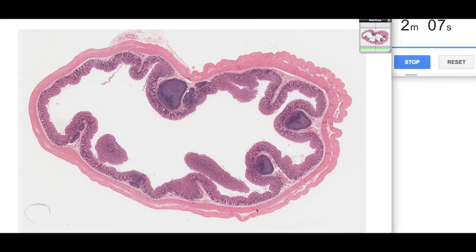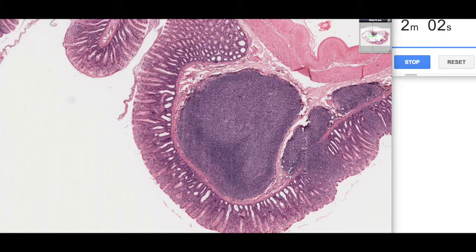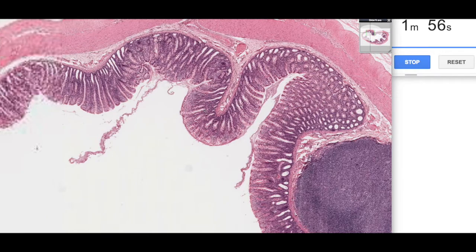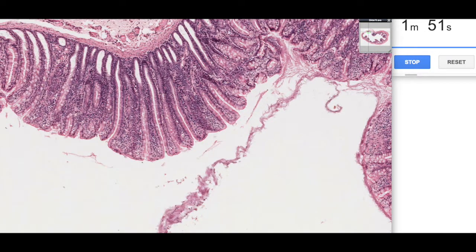If we have a look at a bit more detail of the mucosa, we can see that the mucosa of the large intestine is composed of simple columnar epithelium, just like most of the rest of the gastrointestinal tract, and that we have simple straight tubular glands. So while the rest of the gastrointestinal system is characterized by having glands which are slightly coiled, one characteristic feature of the large intestine or the colon is that they have these simple straight tubular glands.